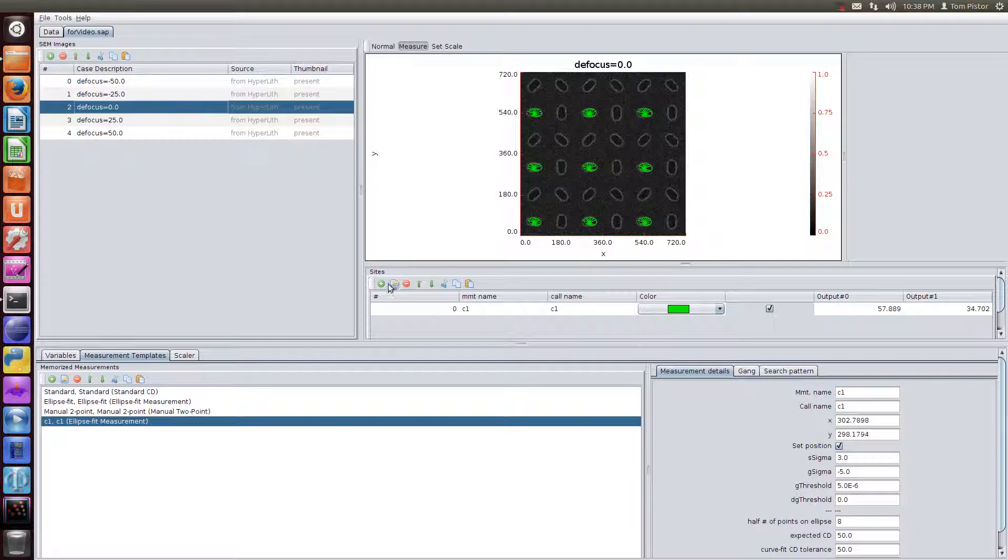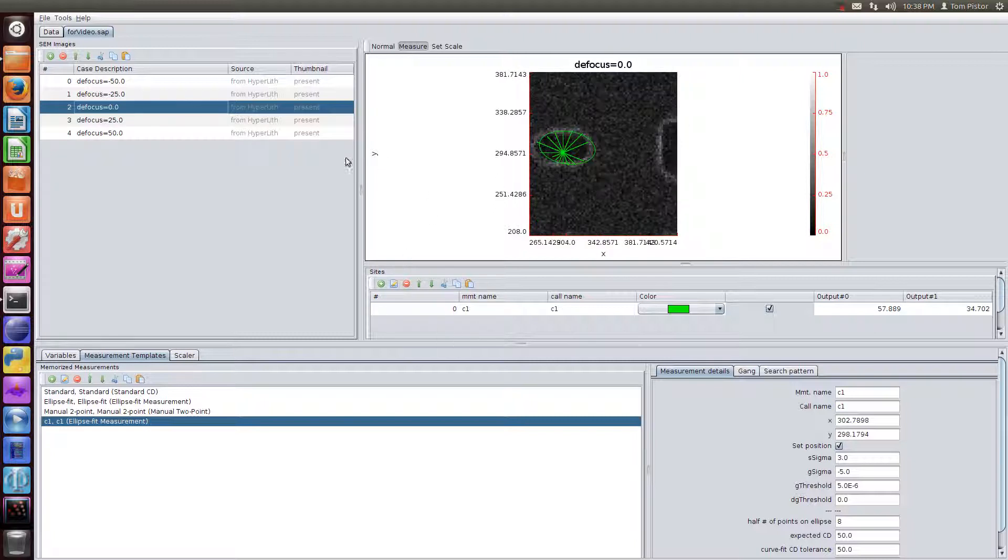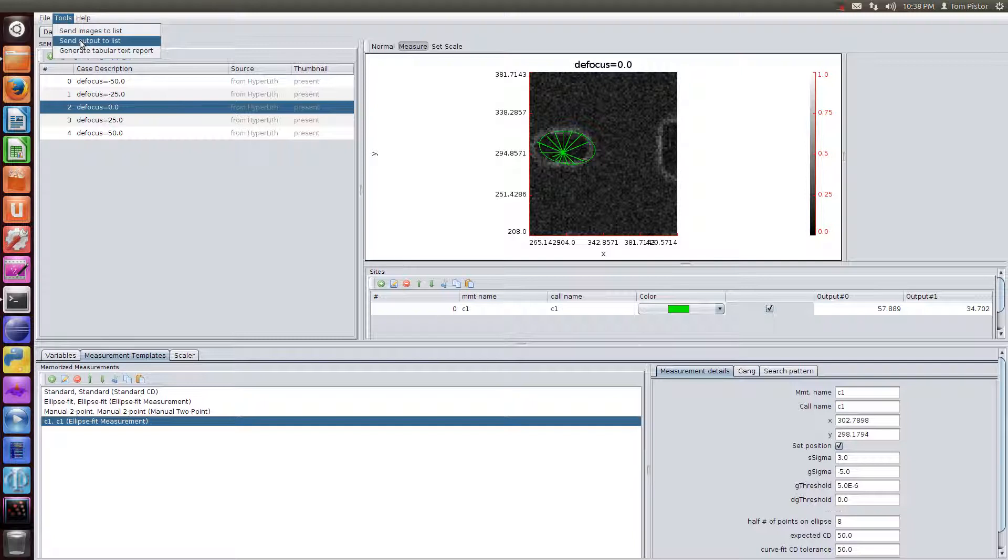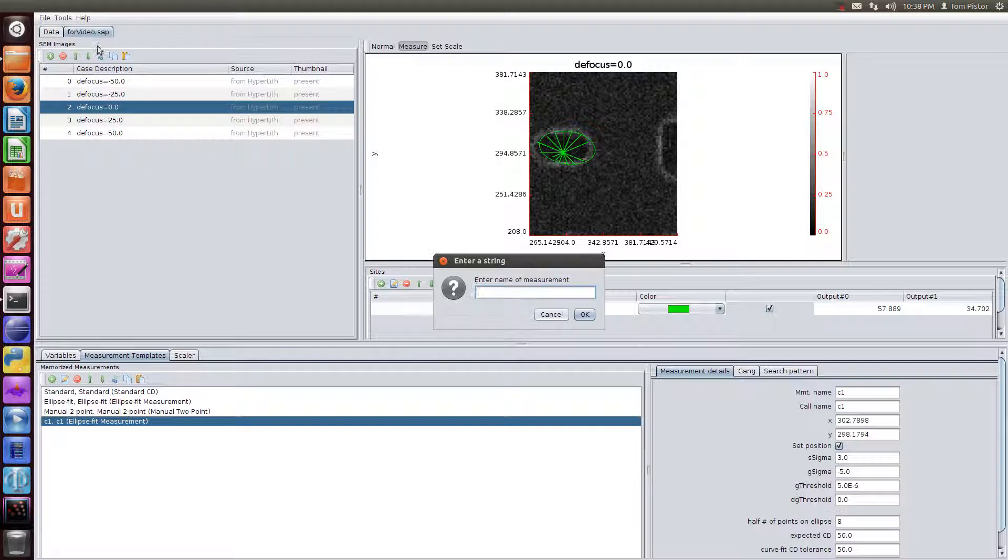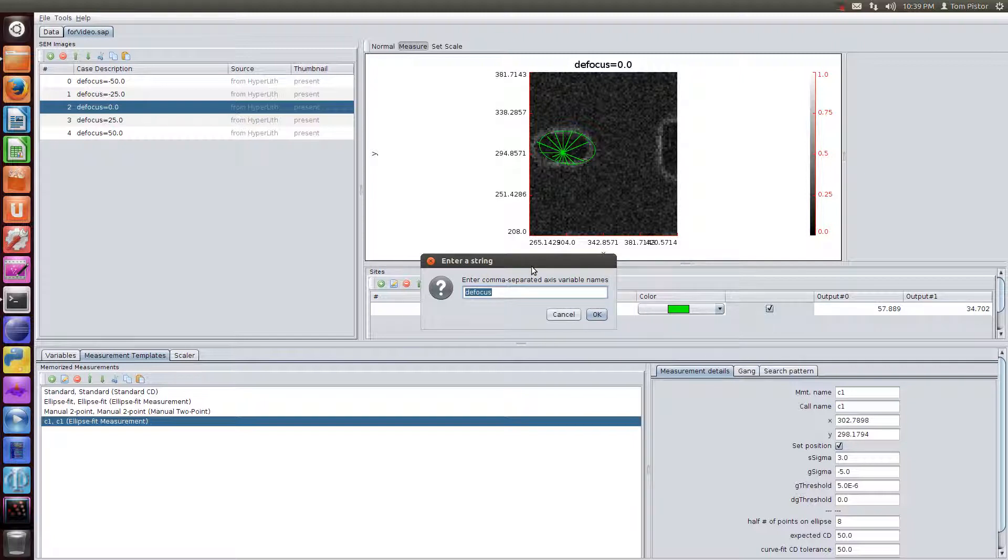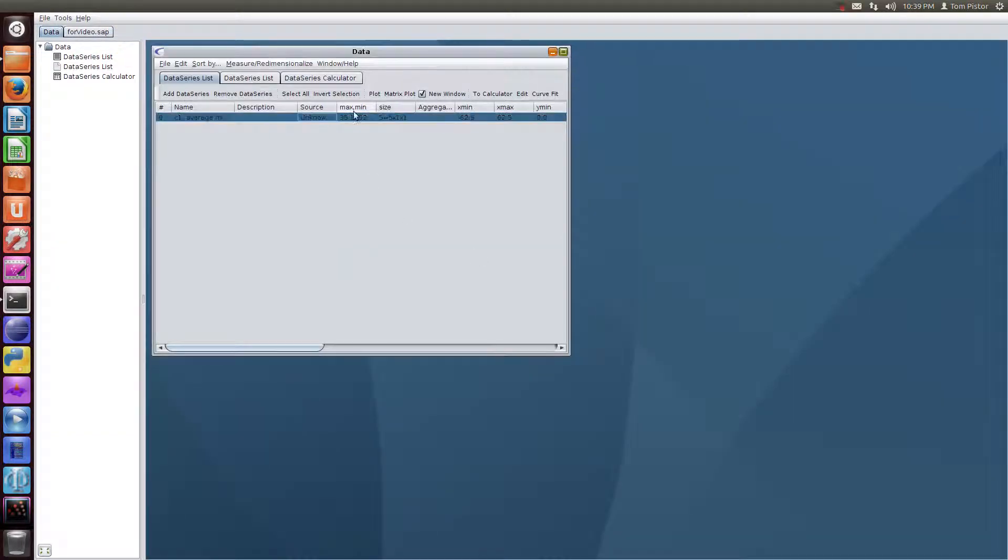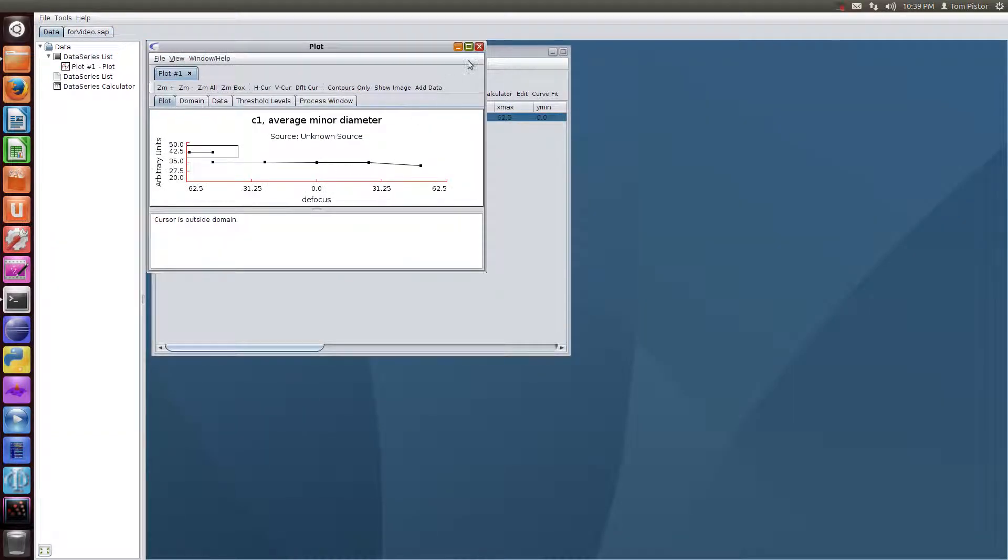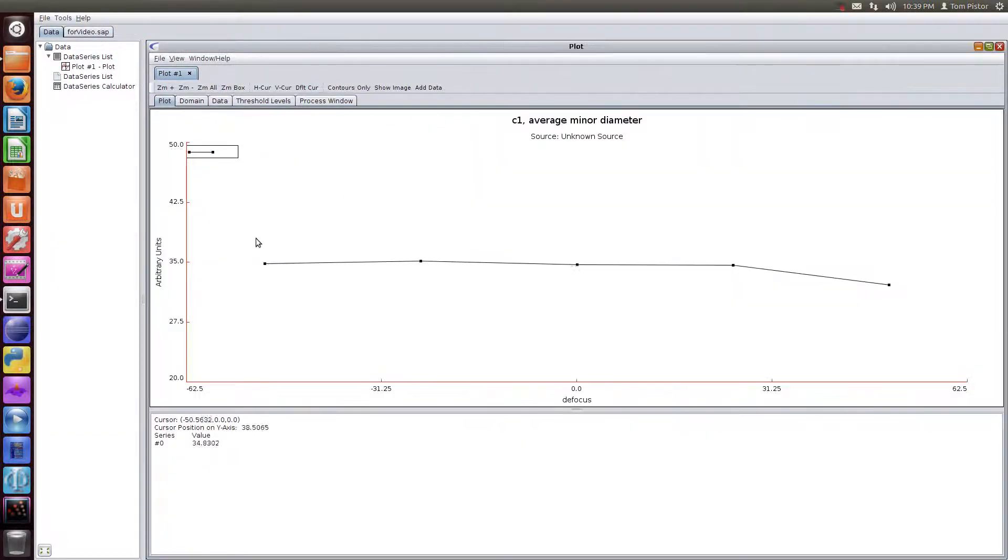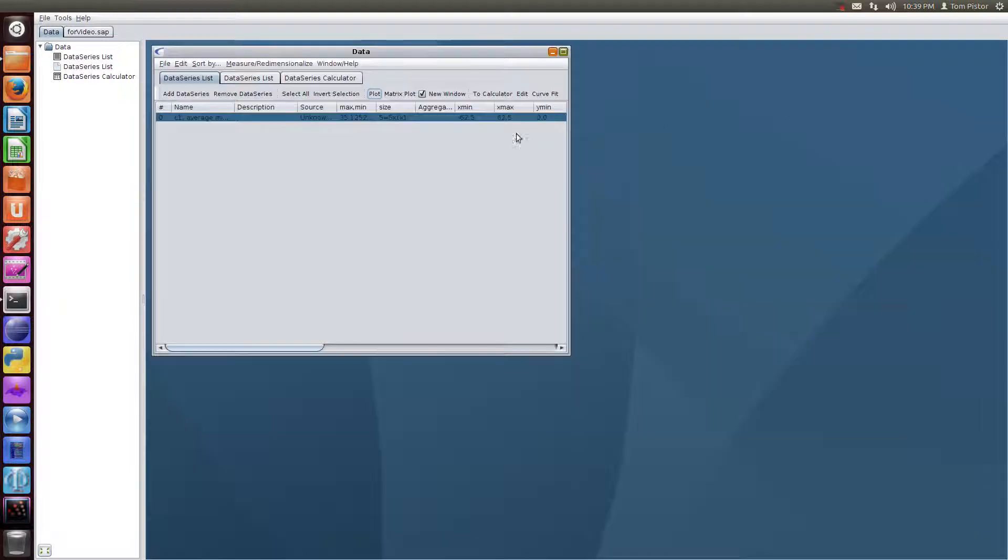And this is another new feature. We can make a report. We could output the contact CD to the list as before. And so here's the CD through focus, and that's averaged over the nine different positions.